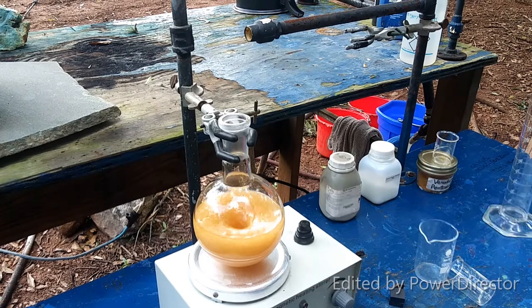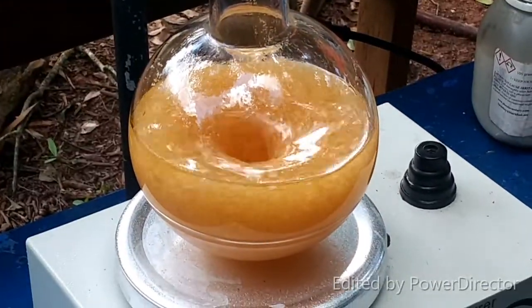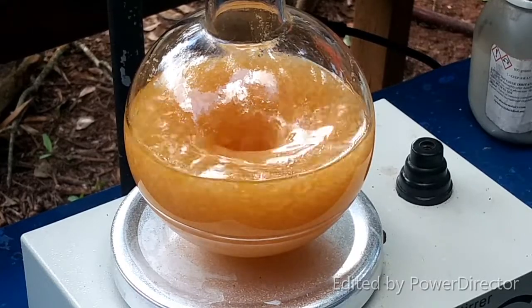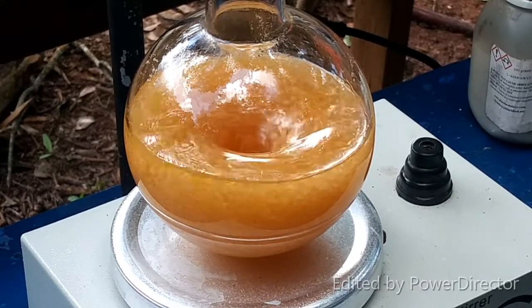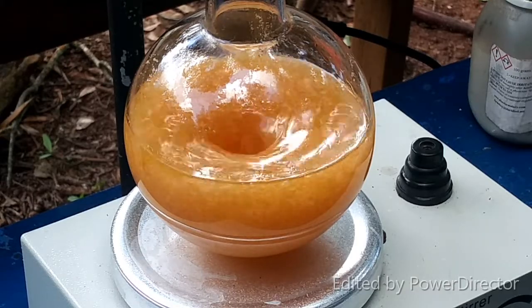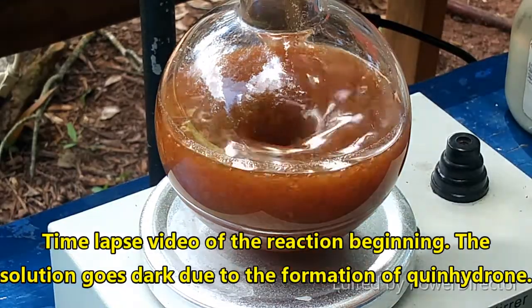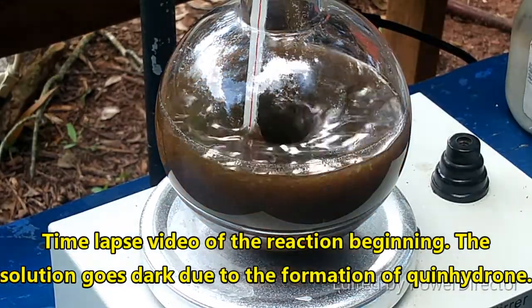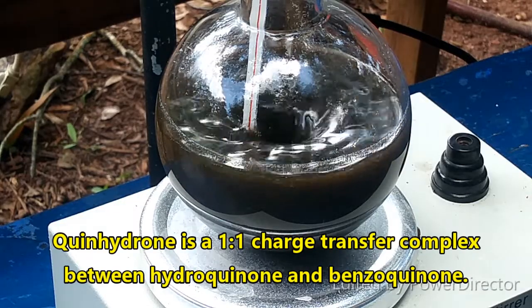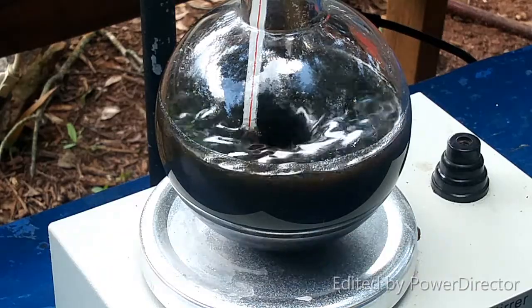Alright, you can see there's our mix. I'm going to go ahead and start the timer now, and we'll come back when there's something to report.